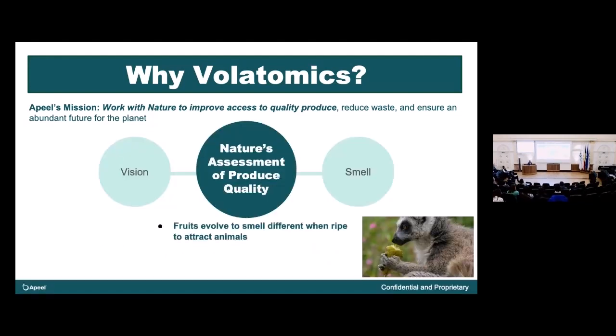spectroscopy, but the other is looking at smell. And so fruits emit a smell, an aroma, to attract animals, but you can also understand some of the quality attributes with the smell as well. And so this points really well towards things like gas chromatography. It's complex mixtures, and so we're looking at SPME and thermal desorption for our sample preparation.